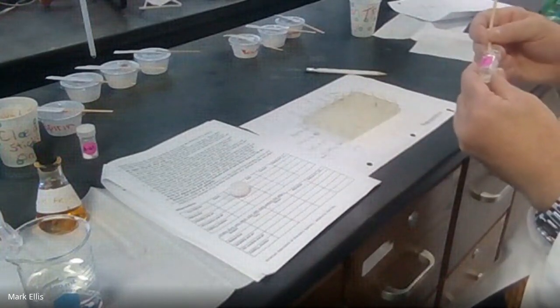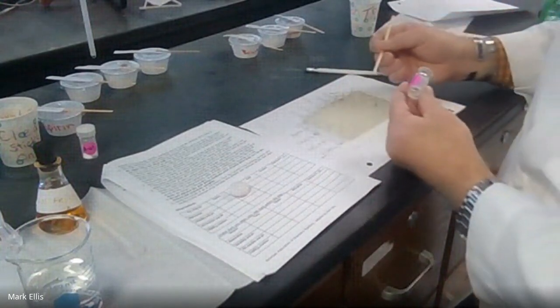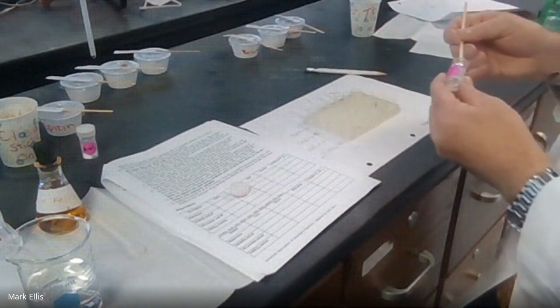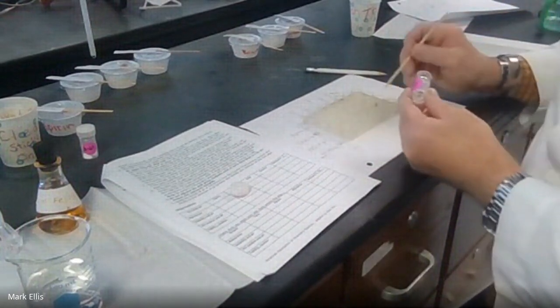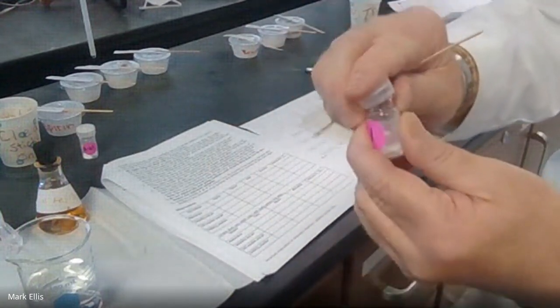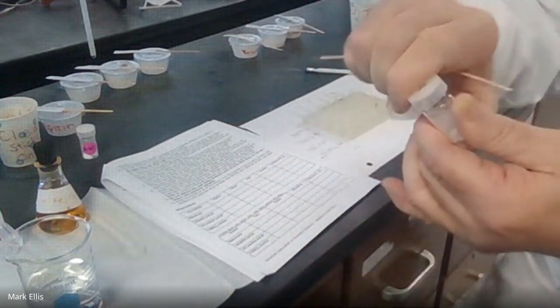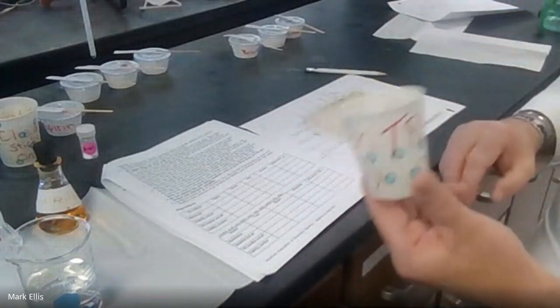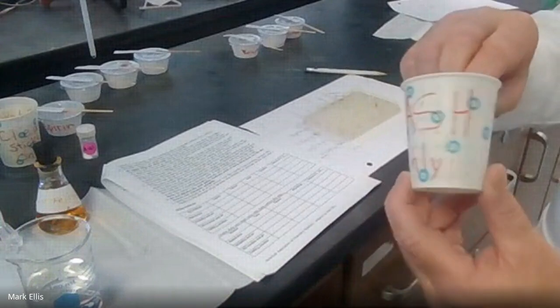This is where you want to work as a team, where someone maybe even puts a finger down on, hey, make sure you do this column. Make sure you do this column. Okay. So I got plenty left in case I mess up and I got to start over. Put the cap back on, and this was for my pain reliever. I don't want to use that for my antacid. All right. I have another cup that says trash only. I don't take anything out of there.